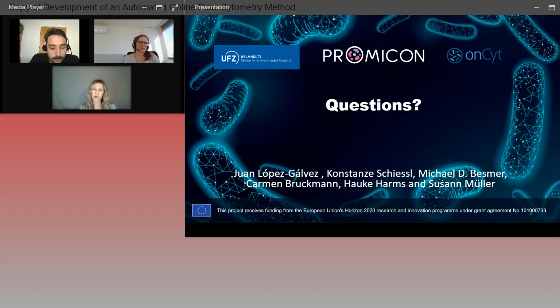Thank you both. Now, while we're talking about DAPI, how complex of a community will you be able to track with the DAPI staining? 3 strains, 30 strains, 300 strains? Yeah, I think the 300, it's very ambitious. But maybe Juan, you can also say something about this. I guess you chose 3 for a reason, or your group.